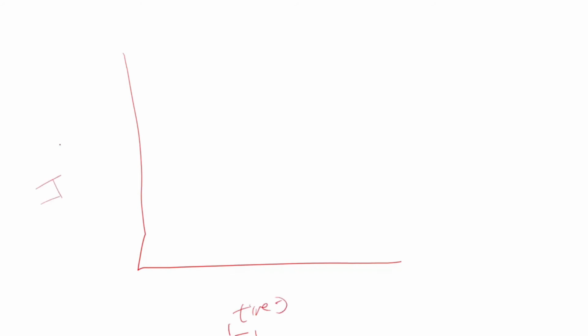I said to you before, how do we get the concentration from IR intensity? So the FTIR which we are integrating with the crystallizer will give intensity. So you have your time on the x-axis, and then you have your intensity on the y-axis. So this is the value that we get from the IR.